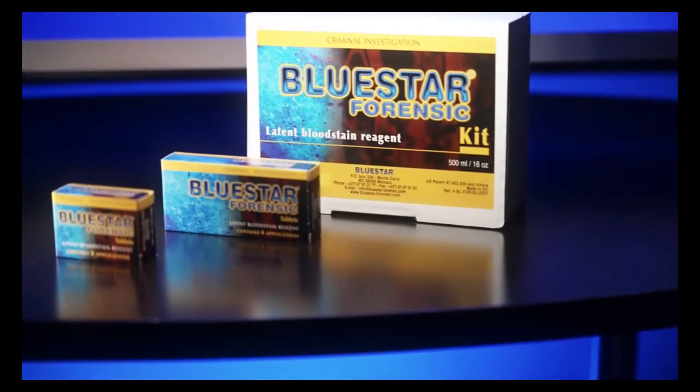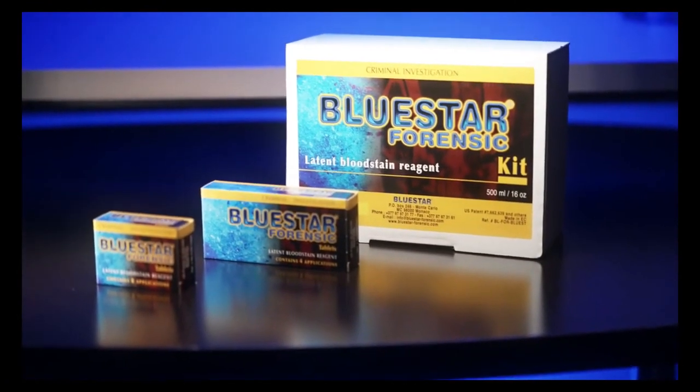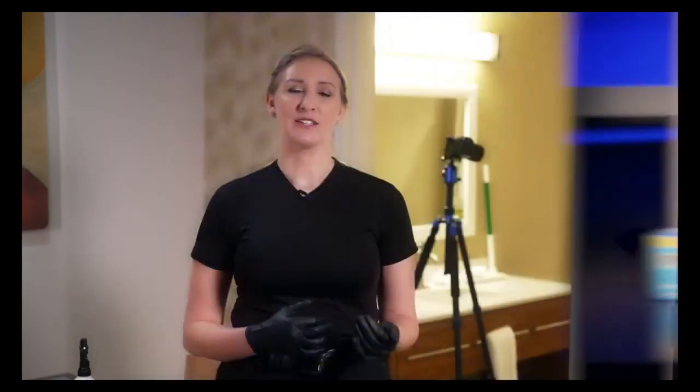Today I'm here to show you how to utilize Blue Star. Blue Star is a chemical that reacts with the heme in blood. Basically we use it at the end of crime scene processing to see if there's any invisible blood or an area of crime scene cleanup.